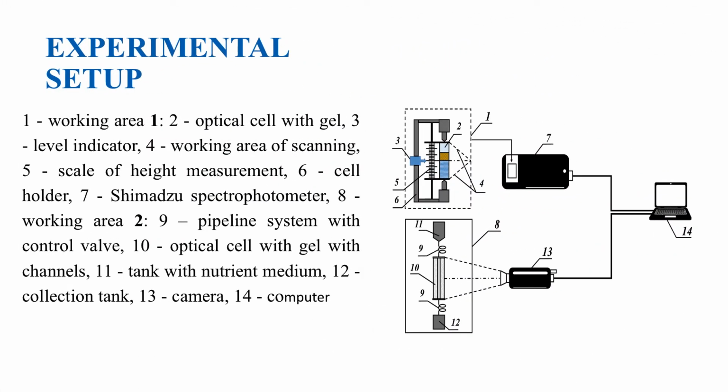Also, remote optical methods are convenient for studying cells in gels because there is no mechanical intervention in gel samples. Here, a scheme of the optical experimental setup is presented with 2 working areas, a camera, a spectrometer, and a laptop for data analysis.